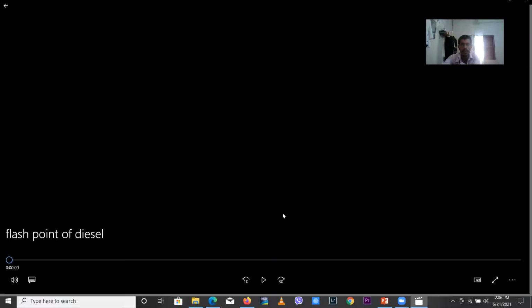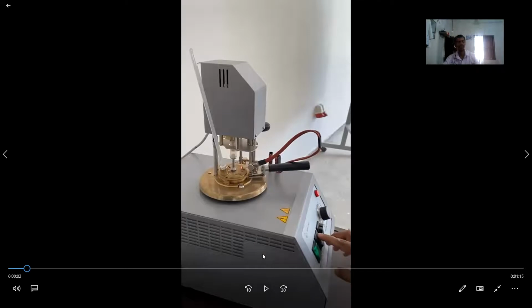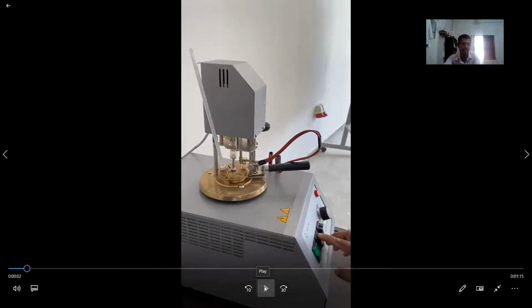Okay, now you will see the flash point of the diesel fuel, right? Now the temperature is 79 degrees Celsius. Up to that point, we increased by 2 degrees Celsius each time, and for each increment of temperature we checked one by one, and we came up to 79 degrees Celsius to find the flash point.